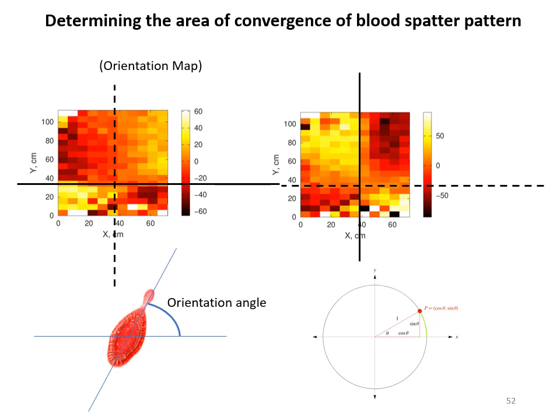So it seems to work reasonably well for impacts that are close to a wall, and for good reason I could explain to you. So obviously, if you have a tool that allows you to fit ellipses, you can start to determine impact angle and use it for reconstruction, even though this is not exactly super important for many casework. It's more important to determine what was the physical reason for those stains that you see.